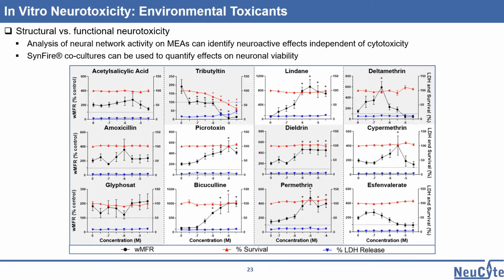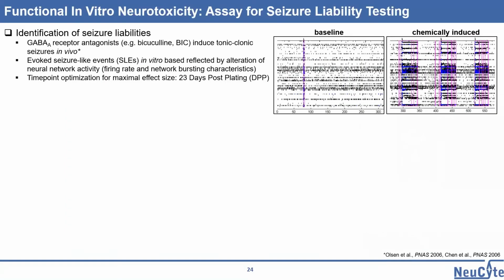So this is nice since we have the mode of action ready. But for an in vitro approach for developing a predictive assay for neurotoxicity, you usually don't know what your compound is going to do. And therefore, a single in vitro assay cannot cover all of the potential toxicity pathways, obviously. So in the next steps, we tried to focus a little bit more on different applicability domains of our assay and characterizing whether it is ready to use for that.